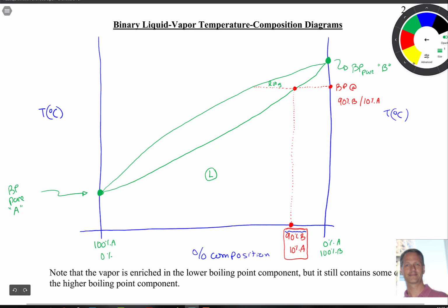And that line is an equilibrium between a liquid and a gas. So a gas is coming off down here. We've got vapor being condensed. So we're condensing right now to this point here, and that's the vapor. And this is what we would collect in our Hickman head, or that receiving flask in the larger scale distillation.